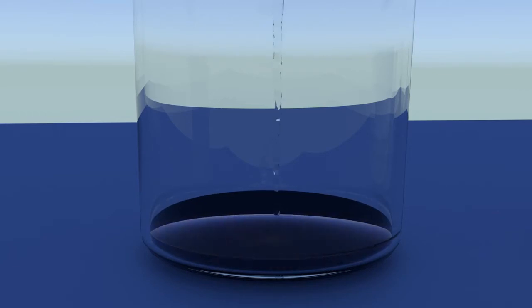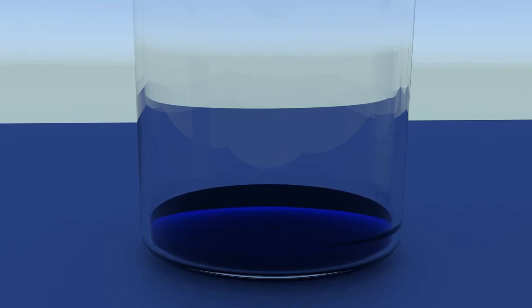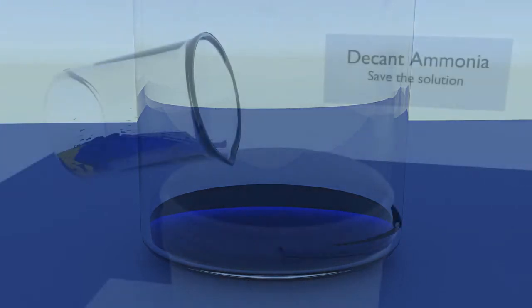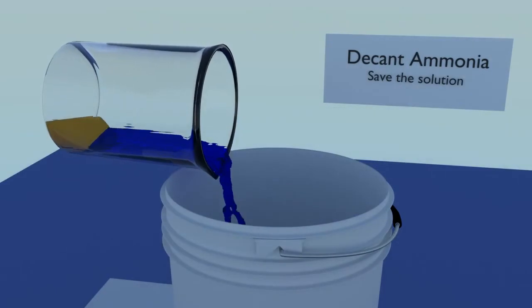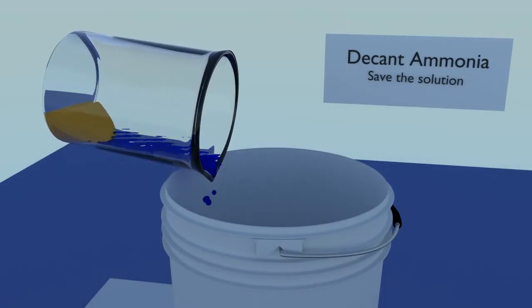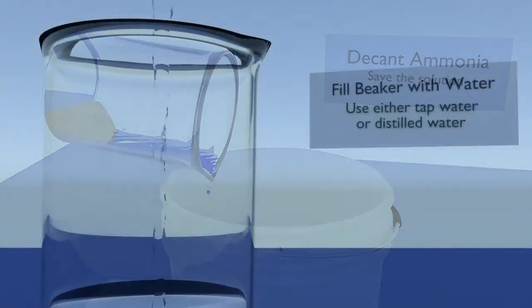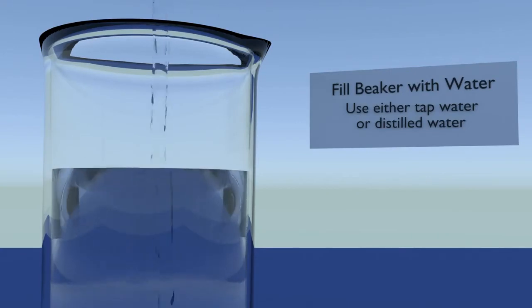The ammonia will rapidly turn blue as it reacts with a small amount of acid that is still clinging to your gold mud. Decant the ammonia, saving the solution. Fill your beaker with water. Tap water is fine.